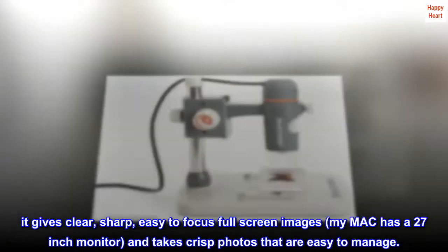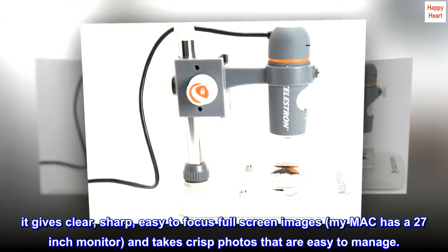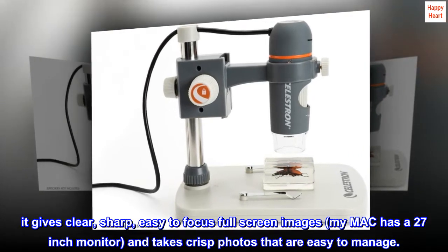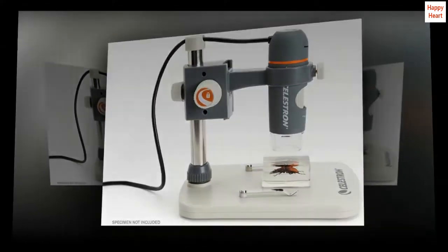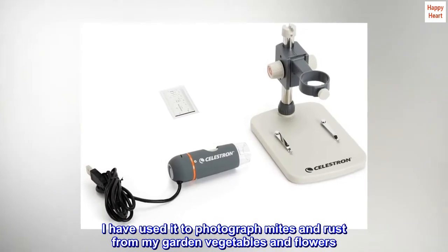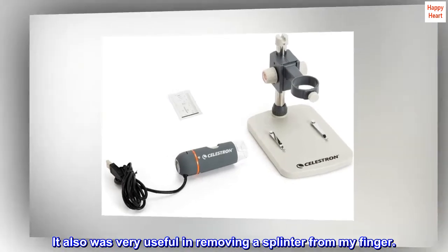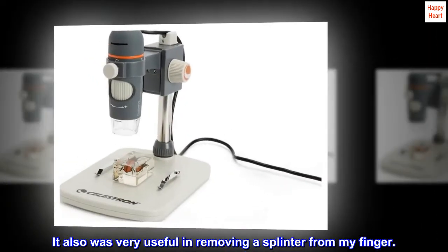It gives clear, sharp, easy-to-focus full-screen images — my Mac has a 27-inch monitor — and takes crisp photos that are easy to manage. I have used it to photograph mites and rust for my garden vegetables and flowers. It also was very useful in removing a splinter from my finger.